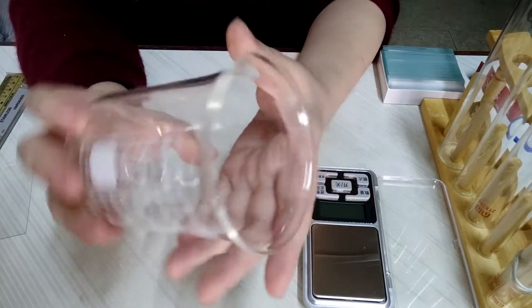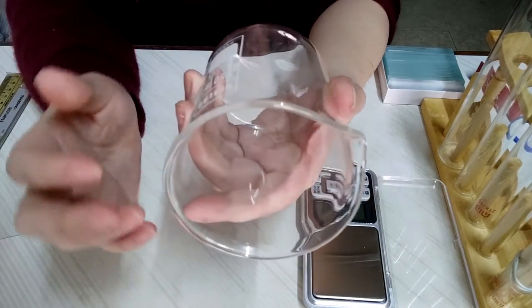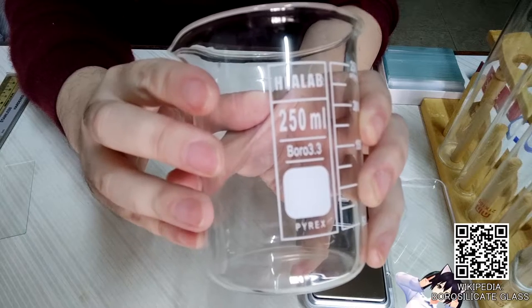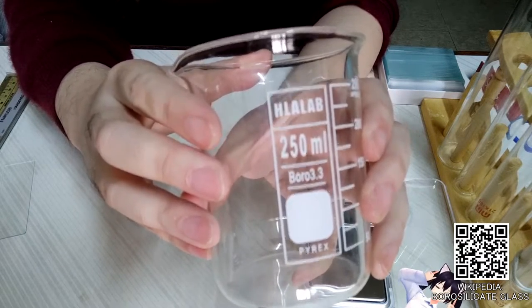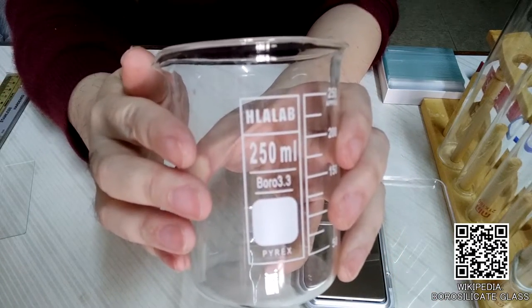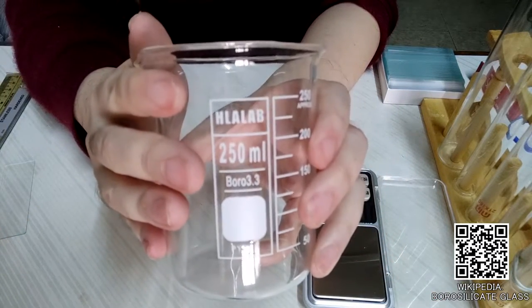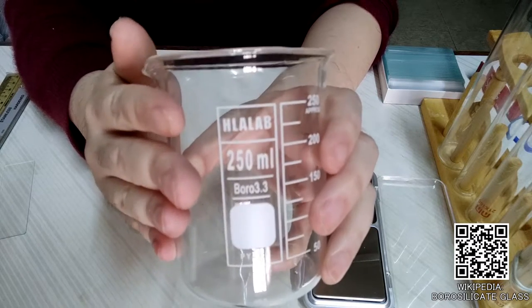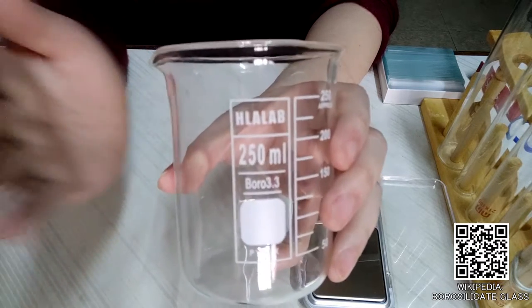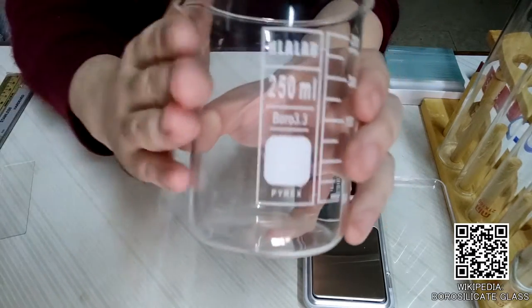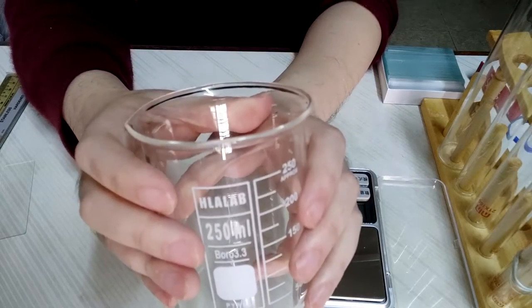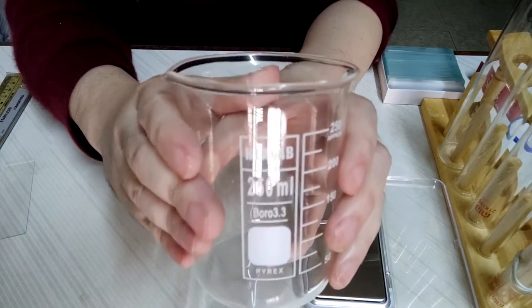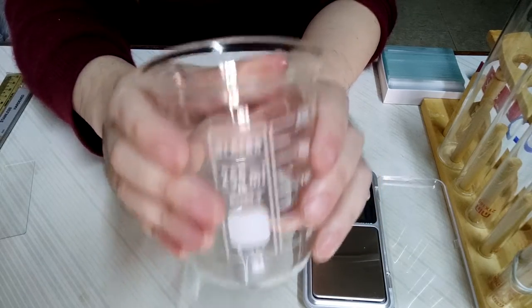And for the other glassware, like this test tube that looks transparent, they are usually something called borosilicate glass. That is glass loaded with boron, which gives it much better mechanical strength and chemical resistance. And practically, it expands or contracts less when exposed to heat or cold, so it is less likely to fracture when you are doing experiments that involve fire or ice.